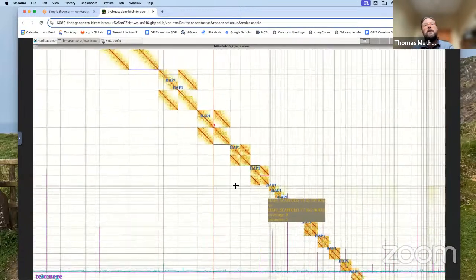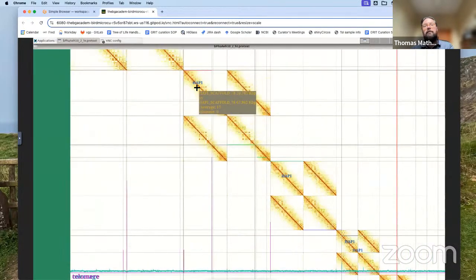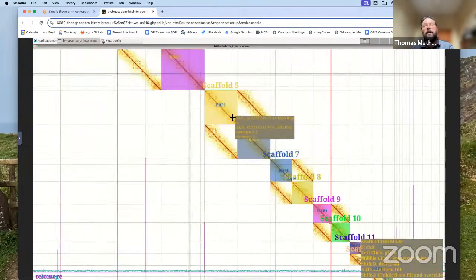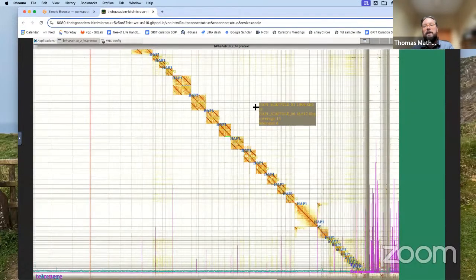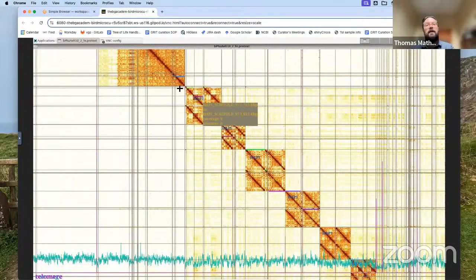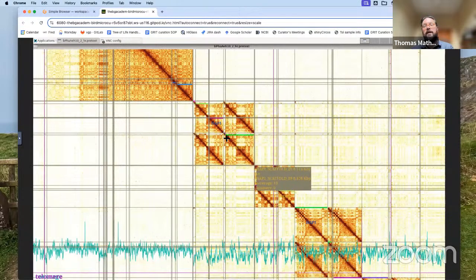So here, all the chromosomes have been put next to each other with their hap1 and hap2 partners. They've been painted up as hap1 and as individual chromosomes. They've been labeled by haplotype, so that when they get spit out, they go into separate haplotypes. At the bottom, we can see what we think of the microchromosomes that we can find in this assembly. You can see individual scaffolds here. This is our elevated Hi-C background. Here's a chromosome, here's the second haplotype, another chromosome, second haplotype.